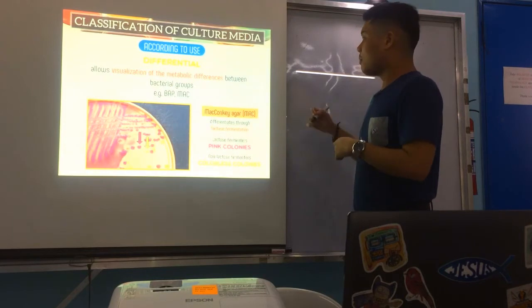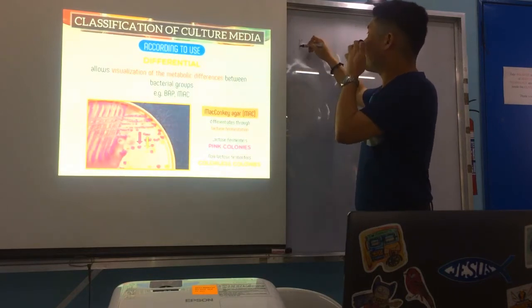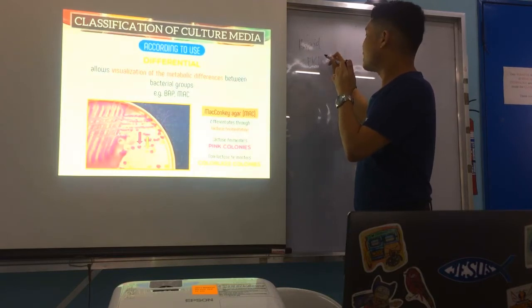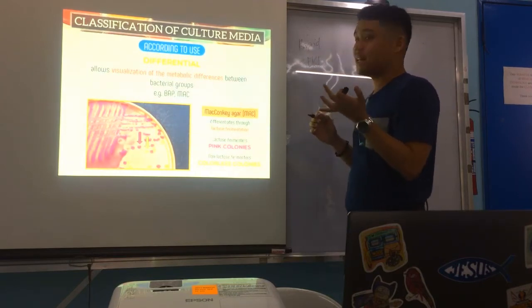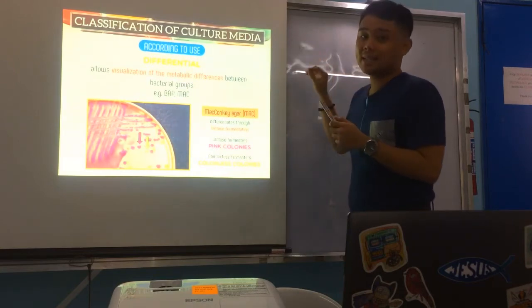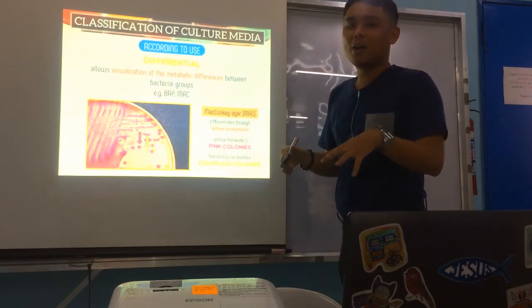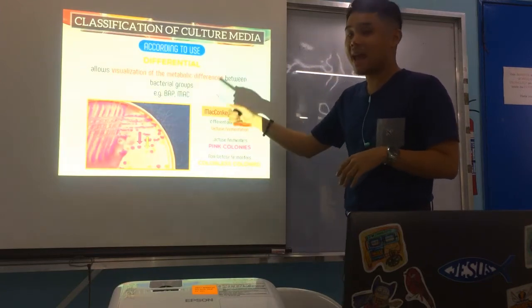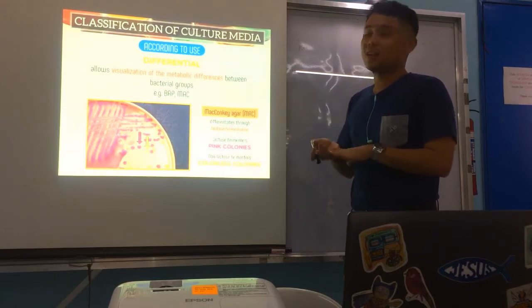Again, I mentioned who the rapid lactose fermenters are, right? We have Escherichia, Klebsiella, and Enterobacter. Again, we'll go deeper into this in biochemical testing. So in intro to micro, it's somewhat superficial. But when you go to biochemical testing for gram-negative bacilli, our discussion will be more intense.